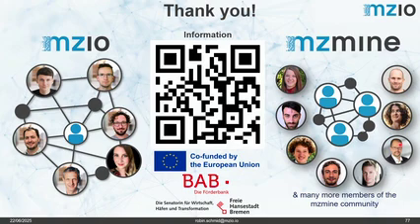Actually, I was also trying the data analysis from Bruker to convert them directly to mzML, but when I try to use those mzML in mzmine, it doesn't work. With mzmine, just don't convert. Yeah, I'm not converting. I learned the hard way, so yes. Thank you. That was my question.